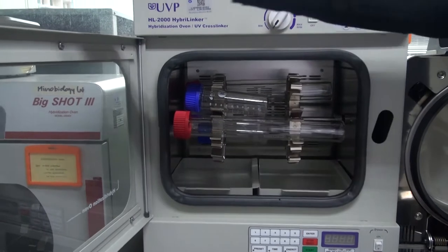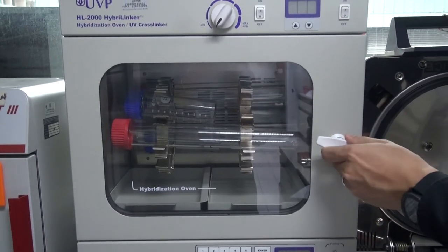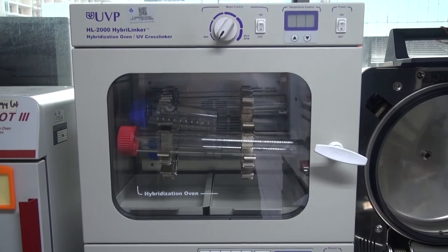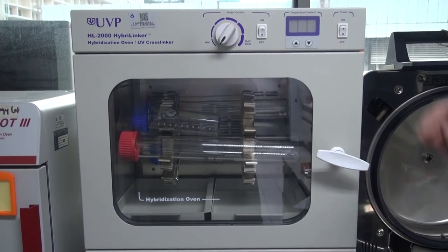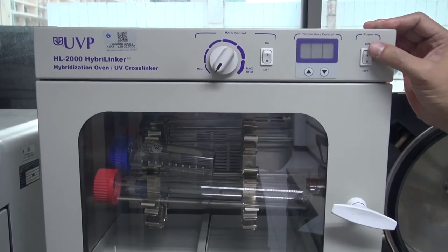To operate this oven, first close the door. And then turn on the main power switch located on the right of the control unit here.